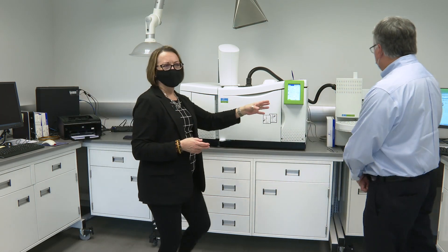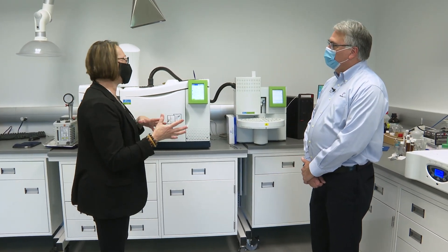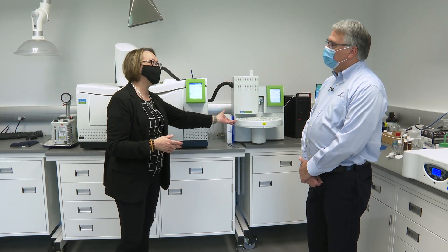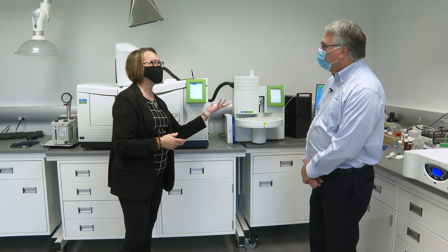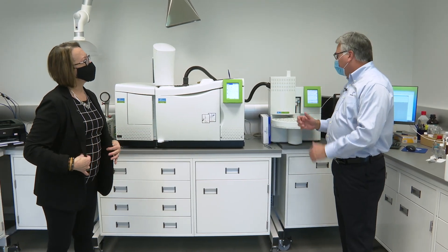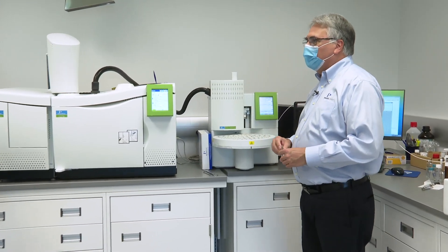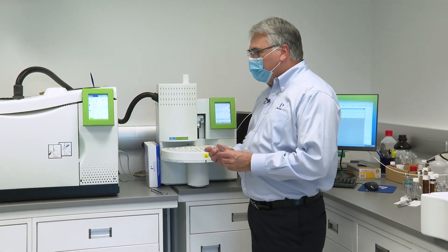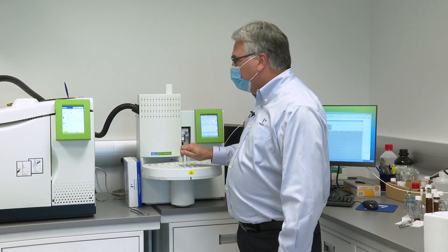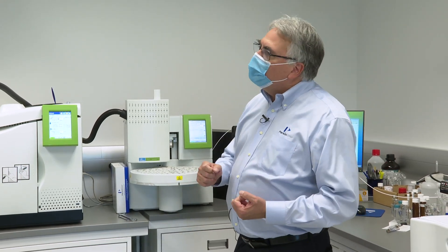Knowing a little bit about chromatography, there are various sample introduction techniques. Can you touch on Headspace and what it's used for? So we have the GC and the mass spec, but we've got to get the sample into the instrument to start with. Headspace is where PerkinElmer has a lot of strength — we have a wide variety of Headspace and Headspace-related instruments. Headspace is a technique where we put a sample into a glass vial, put a cap on it, and then bake it in the instrument for a few minutes in order to evolve the volatile compounds that may be present.